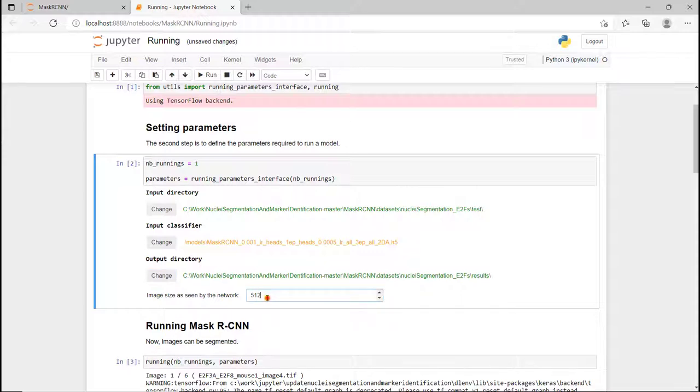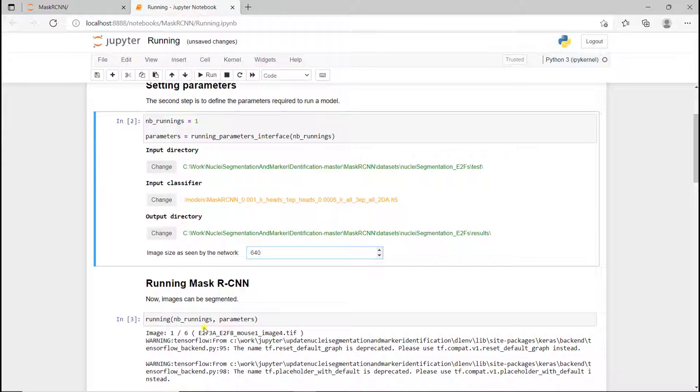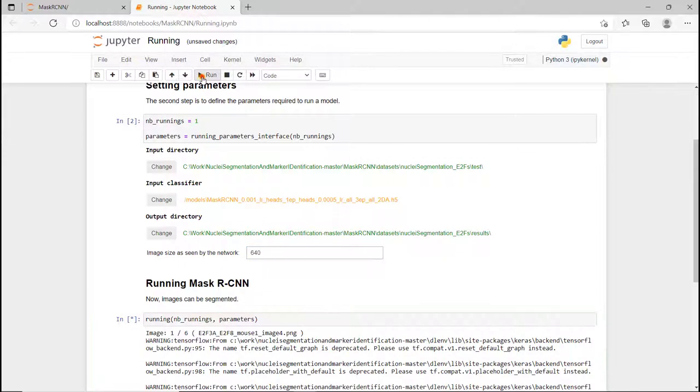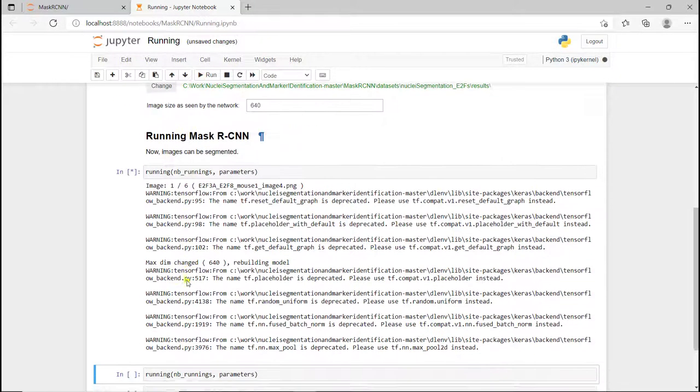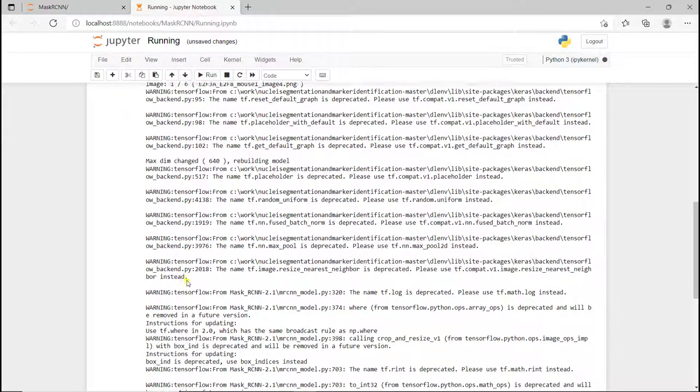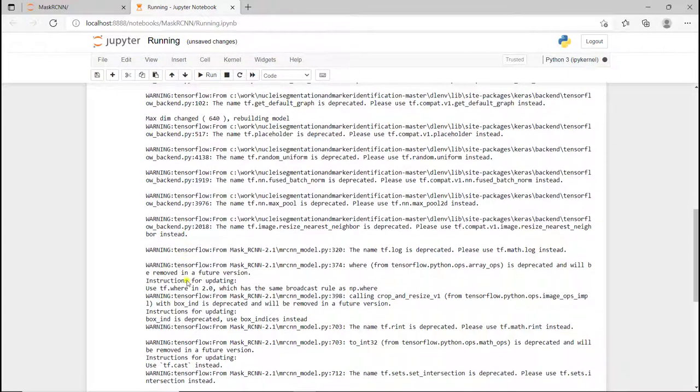As we do data augmentation, we actually crop and zoom in. When you do this augmentation, it's better to give a higher size of network than the one it's been trained at. If you don't do the augmentation, you just define the same size. And now it's running.